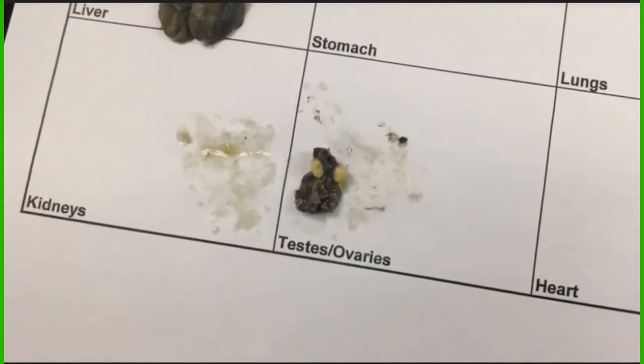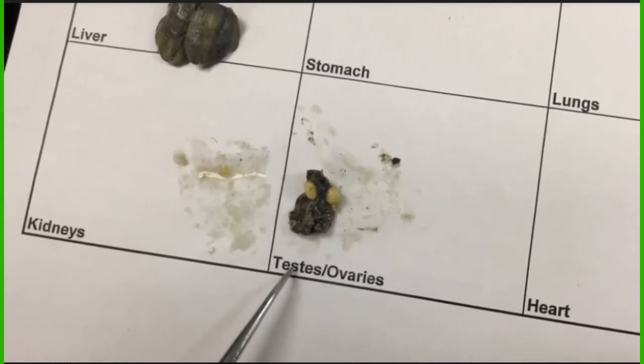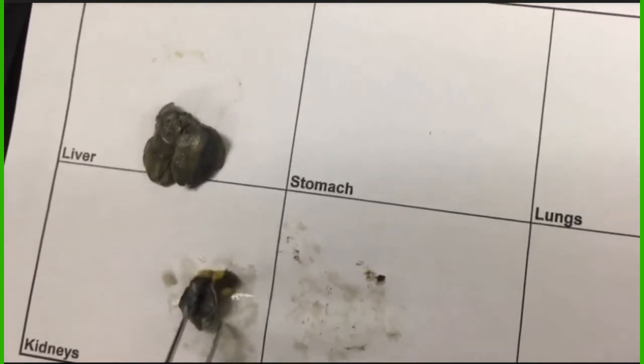And I thought I would throw in the comparison with the ovaries. There's the testes. You see them on either side of the kidney. They're still attached to the top of the kidneys. And that frog is coming into breeding condition where the testes are fairly large. So I'm turning it over so that you can see that's the kidneys on that side.